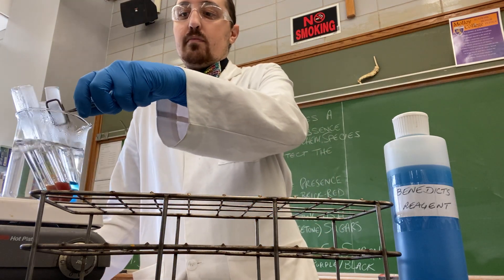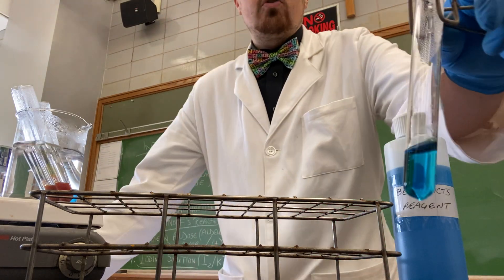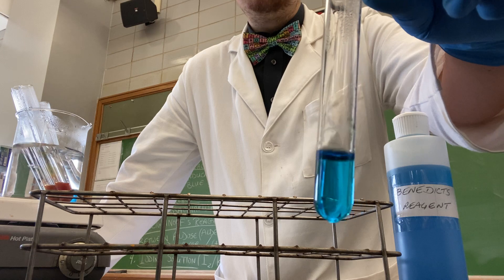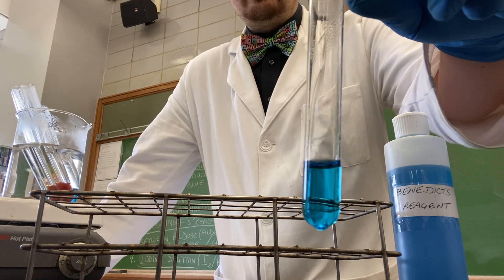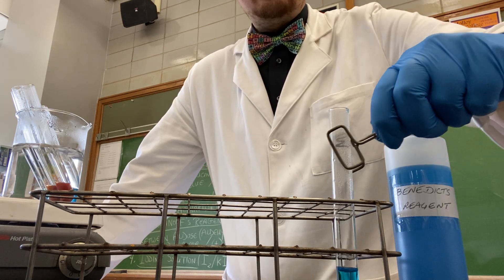The water is serving as our control group, which will show a negative test for reducing sugars. Here we see the solution has remained a blue color, indicating a negative test.